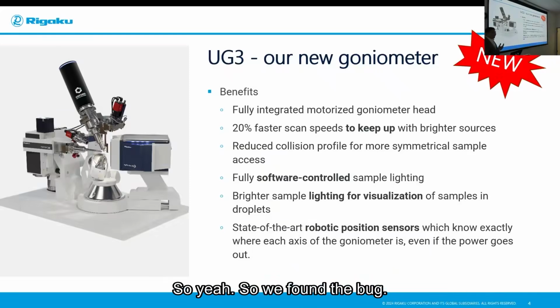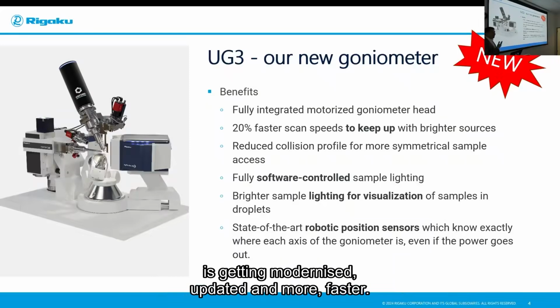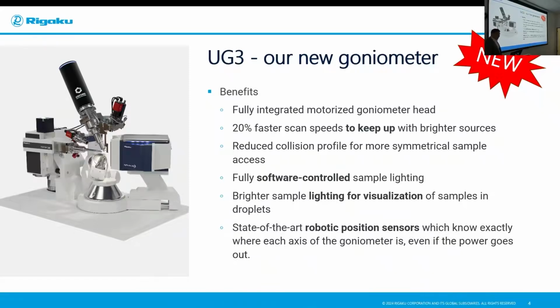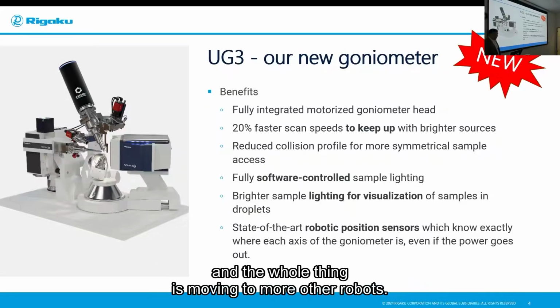So we press the button, would you? Yes. So there is lots of updates, that you don't see on the first place, but the goniometer is getting modernized, updated, and more faster. And we also changed something for lighting for visualization, which I can show you because I got a few new slides. And the whole thing is moving to more as a robot.